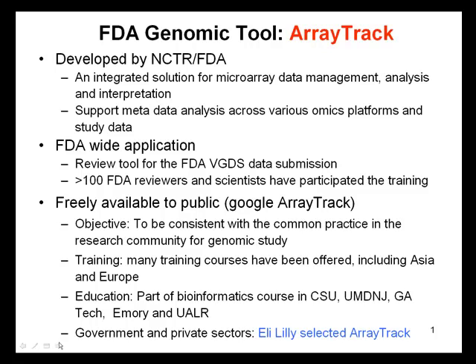Now, ArrayTrack is popular among all the FDA centers. In fact, it's the key review tool used for the FDA Voluntary Genomics Data Submission Program. It's also been used in the Microarray Quality Control Program, and over 100 FDA reviewers and scientists have been trained to use this tool.